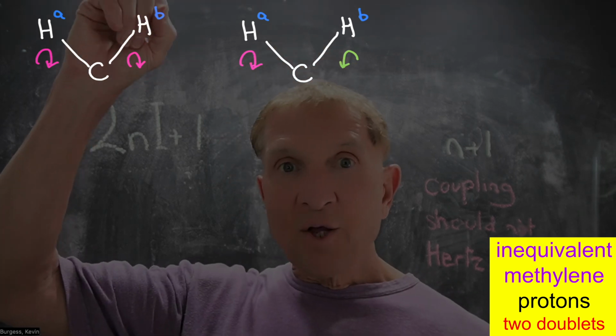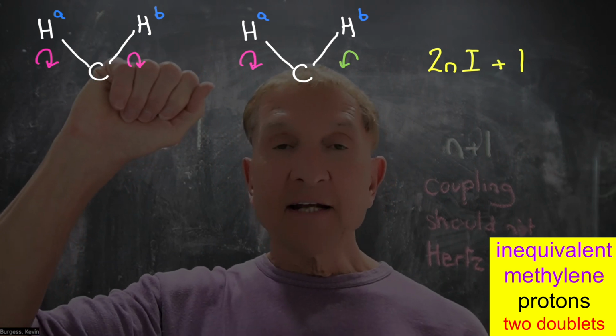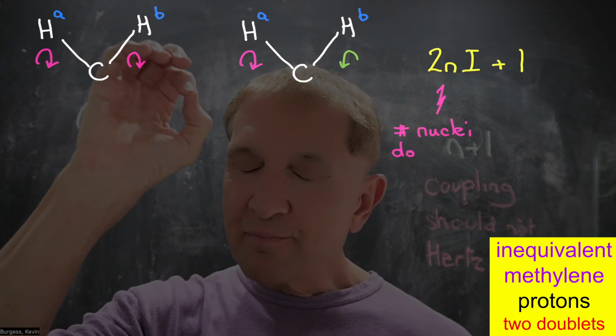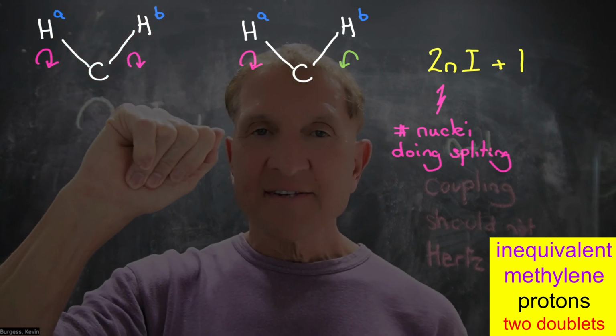Pop. We just lowered the sample into the NMR against the counterflow of air, and it makes that nice plop sound as it seats in the magnet.